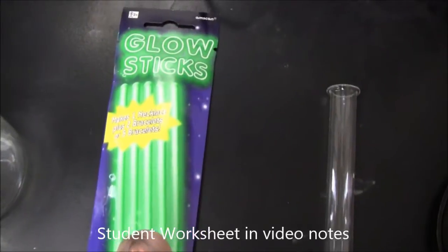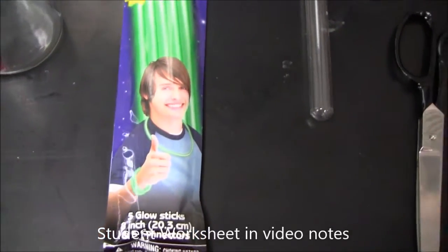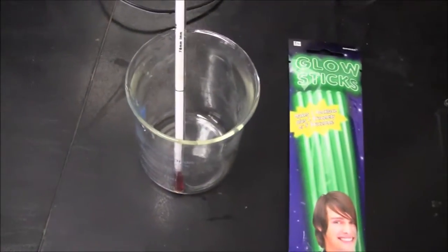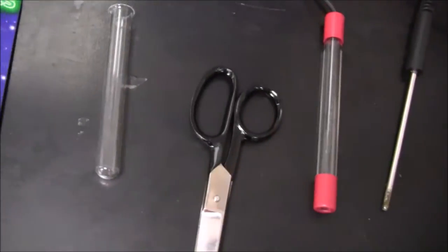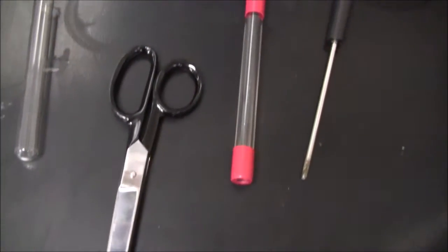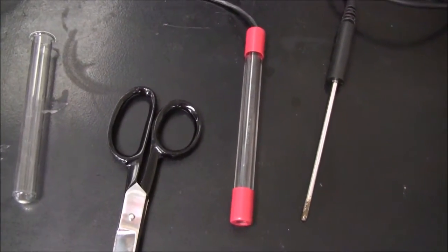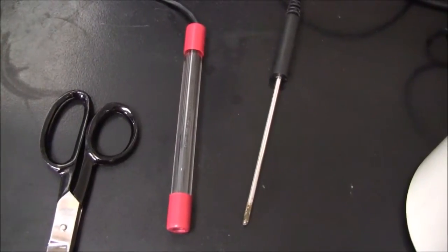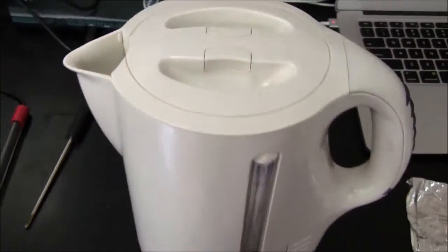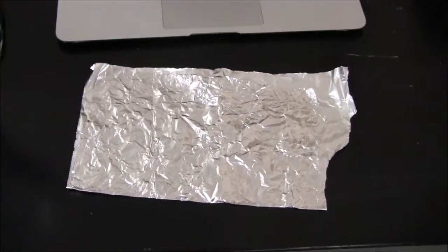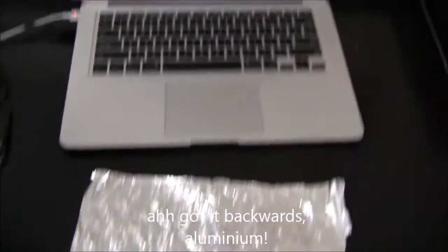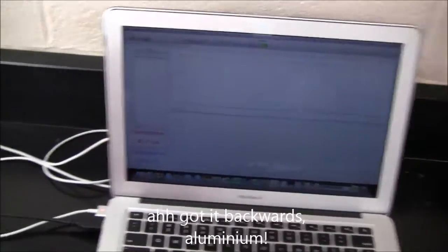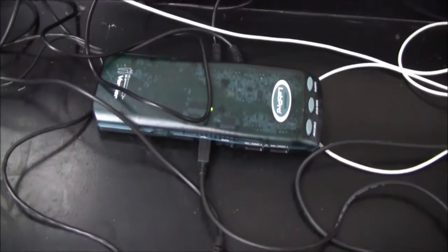So you'll need some glow sticks, green ones preferably because I know the activation energy for that one. Thermometer, beaker, test tube, scissors, light sensor, thermal probe, kettle, some aluminum foil, and a computer with the Logger Pro all set up.